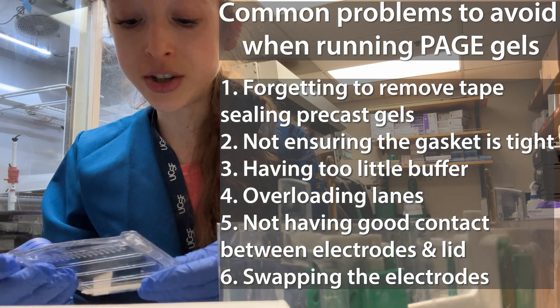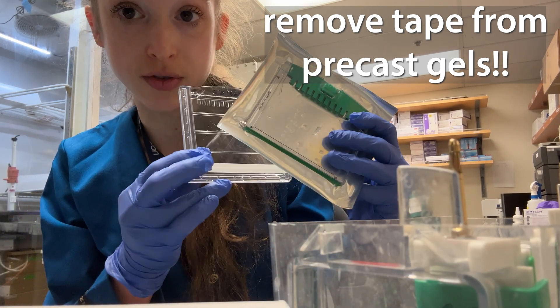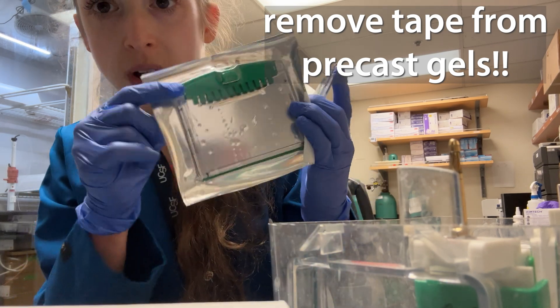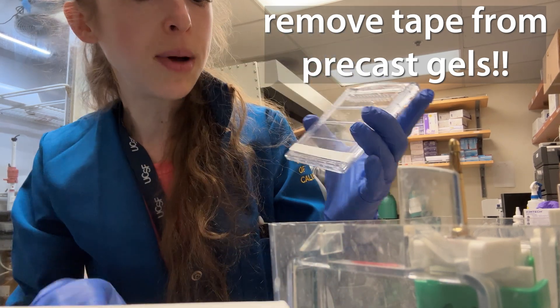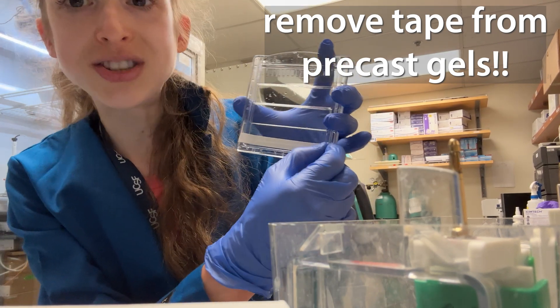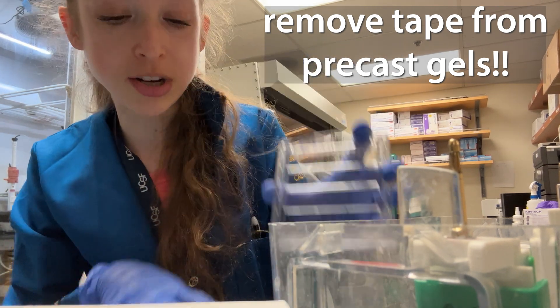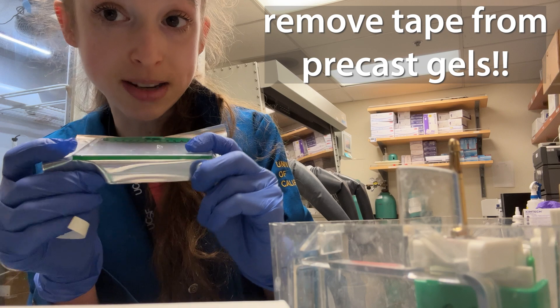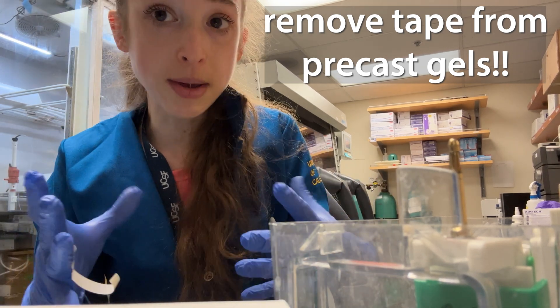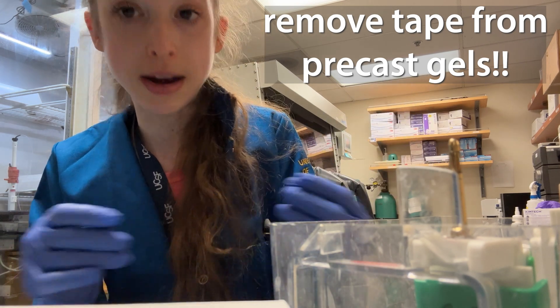First off, make sure that if you're using a precast gel — one of these pre-made ones — you remove the adhesive strip. This strip is there so that liquid doesn't leak out while the gel is in the package, but liquid needs to get through the gel when you're running it. You need to remove that tape. It could be on the side with some Novex gels, or on the bottom with some Bio-Rad gels. Sometimes if you're coming from making your own gels, you're not expecting the tape — so remember, there's tape, and remove it.